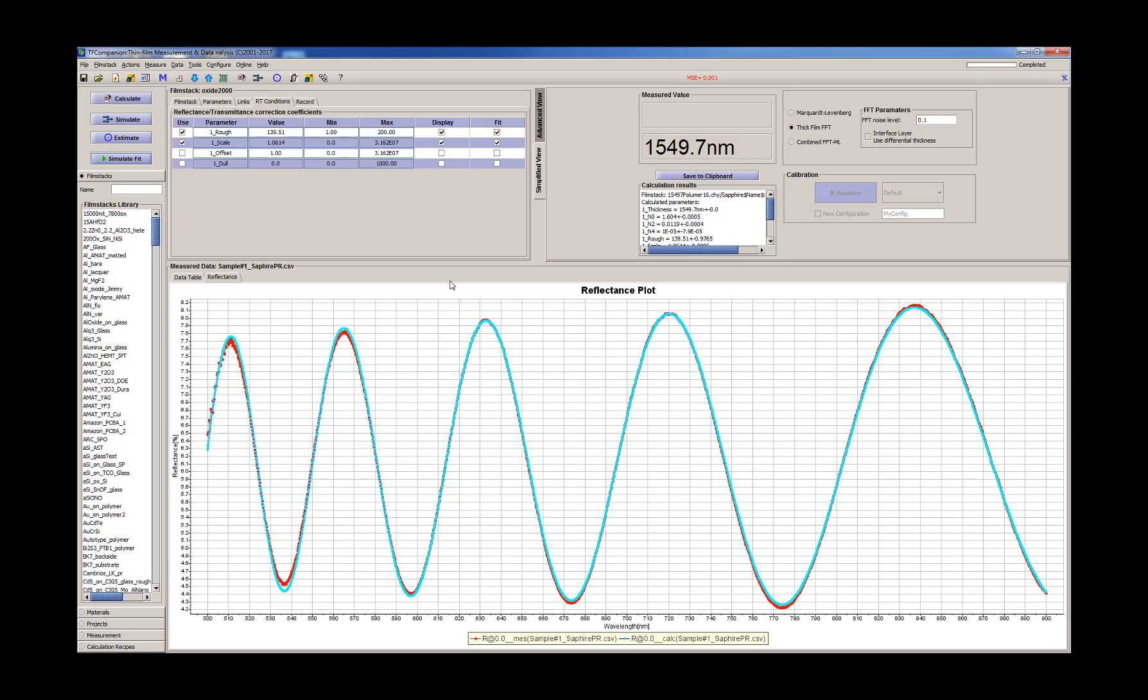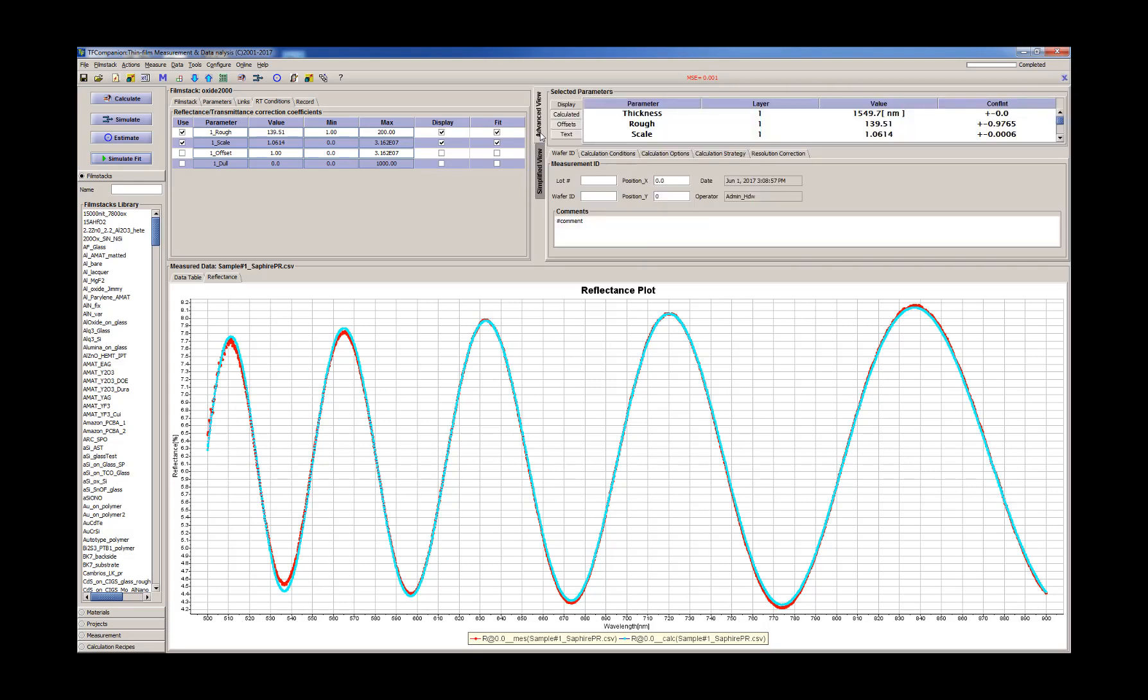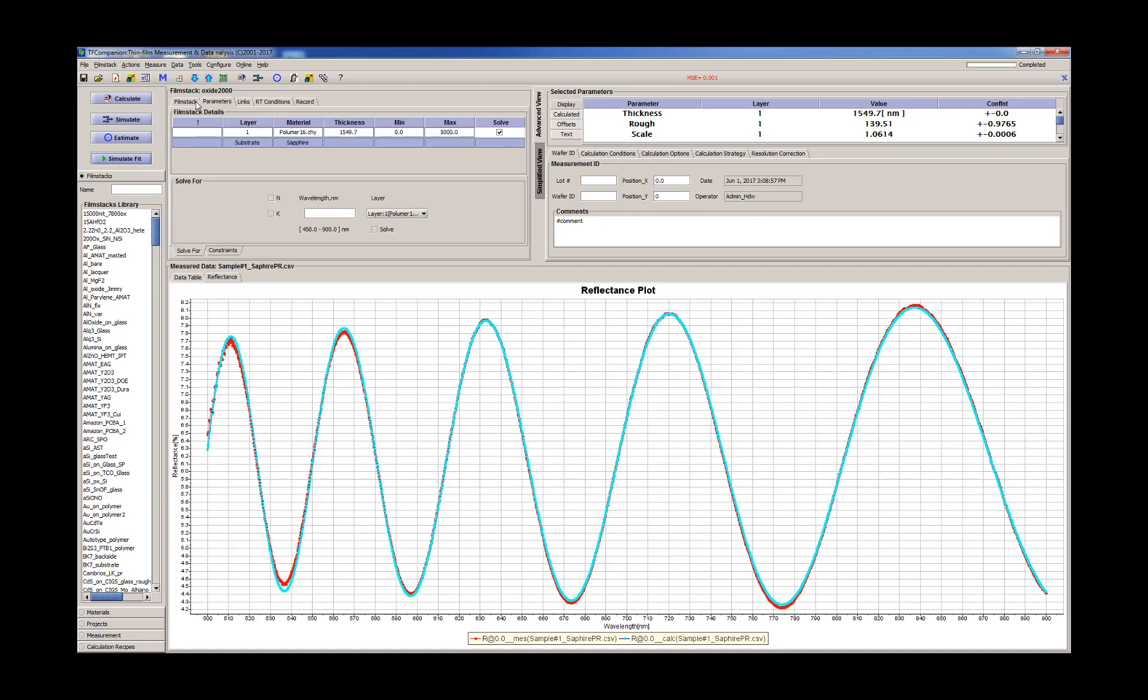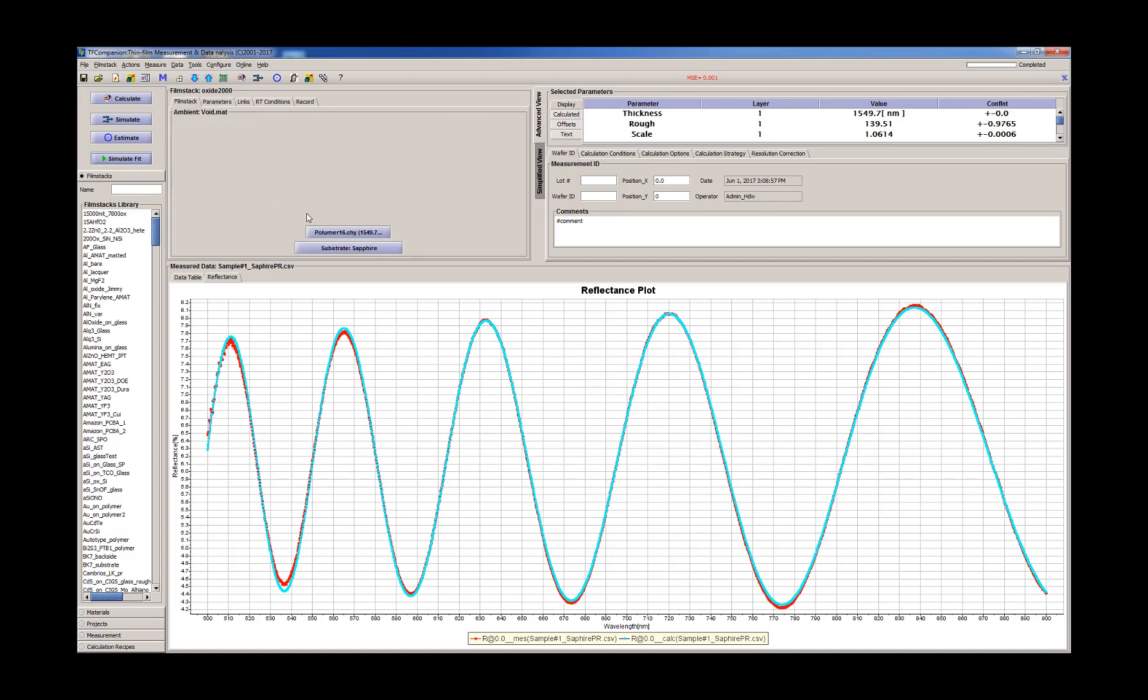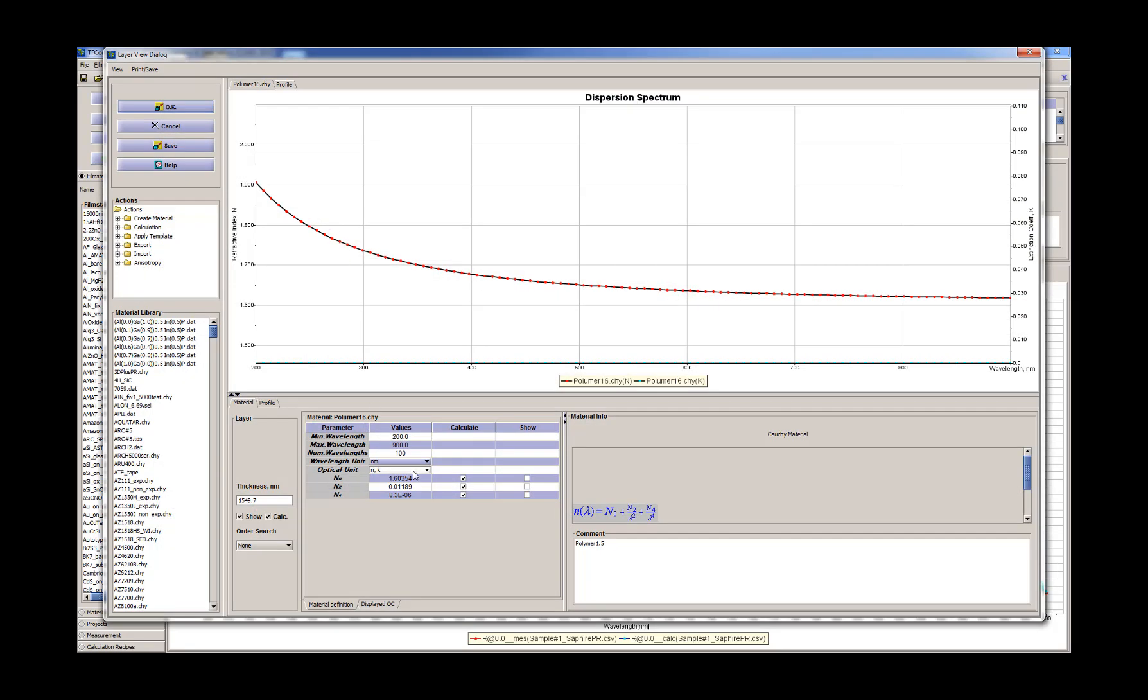And now we can use the thick film algorithm in measurement of other samples. But before we do that, let's just try to check two things. First, we want to check that our optical constants are reasonable.